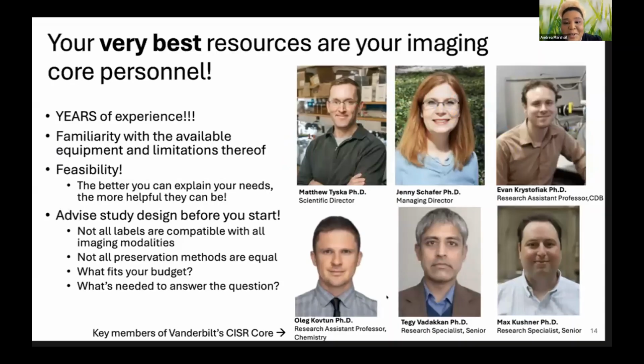And shout out to all of our people who run cores. Your very best resources, in my opinion, are your imaging core personnel. They have years of experience. They have familiarity with all the equipment that is present in their core. They've seen potentially many projects like yours, or people who have asked similar questions, and can give you very good advice. Also, they can give you feasibility.